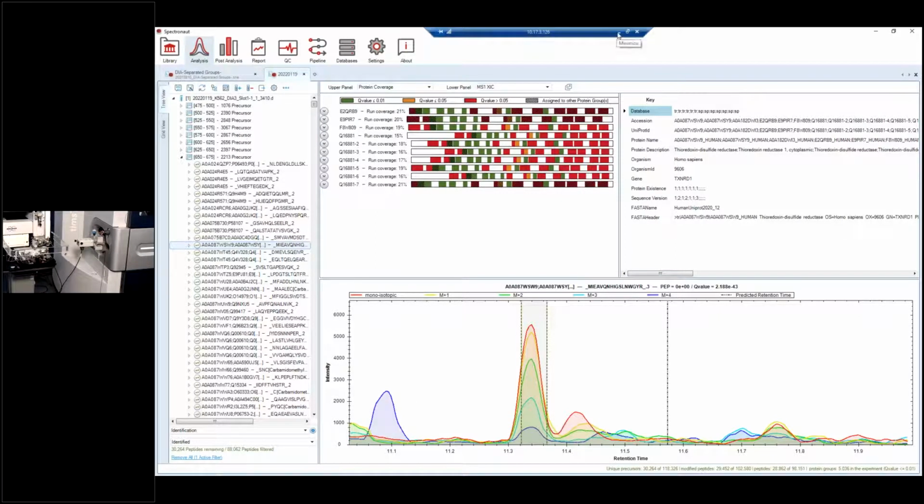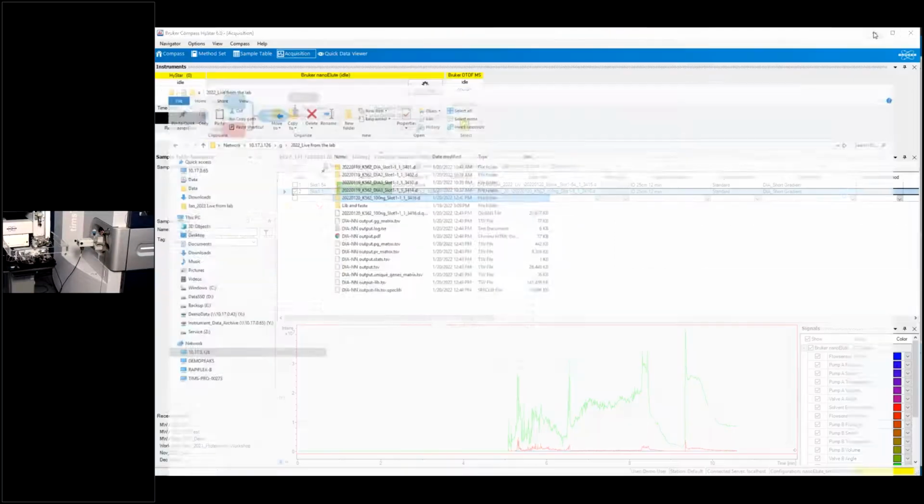Okay, so I know we're getting shorter on time here, so I wonder now if it's a good chance to see if anybody has any questions that we can answer. Yeah, hey Matt, thanks for that.